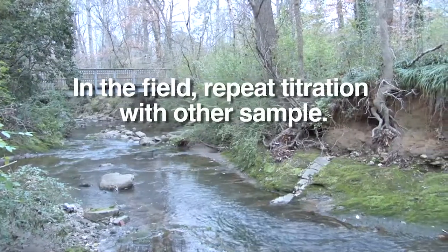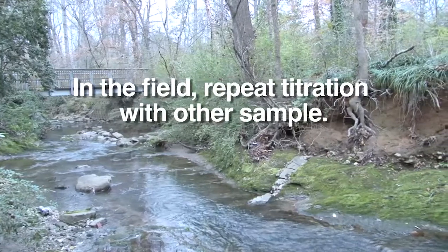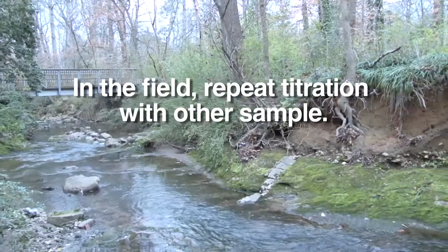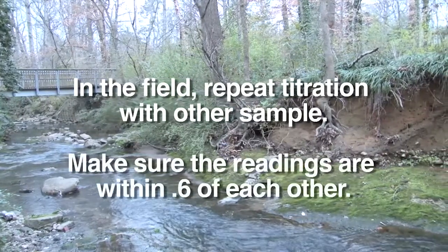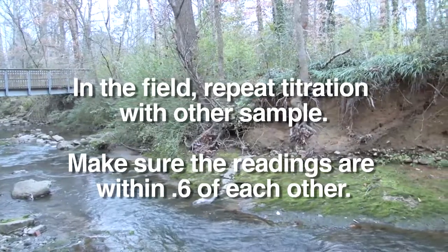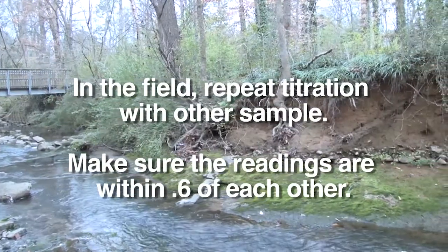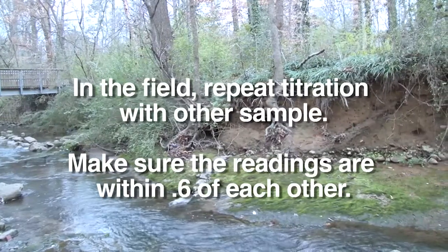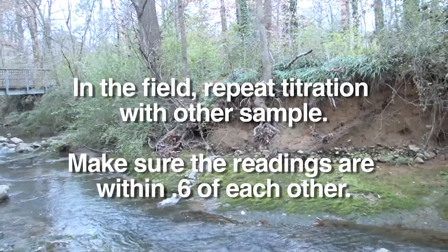Tara's doing one example here. In the field, you repeat the titration with the second water sample. Our quality assurance requirement is that you obtain two readings within six-tenths of each other. If the second sample reading isn't within that range, collect more water and repeat the process. Any two measures within a range of 0.6 constitute a valid sample.